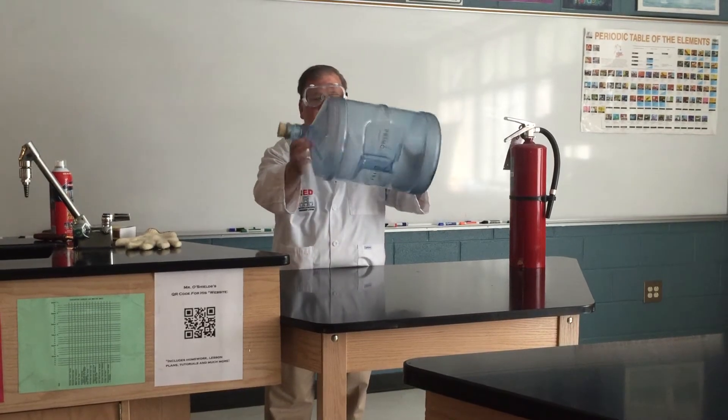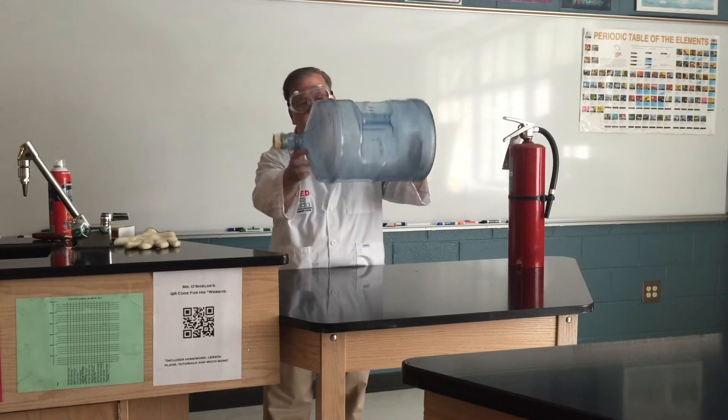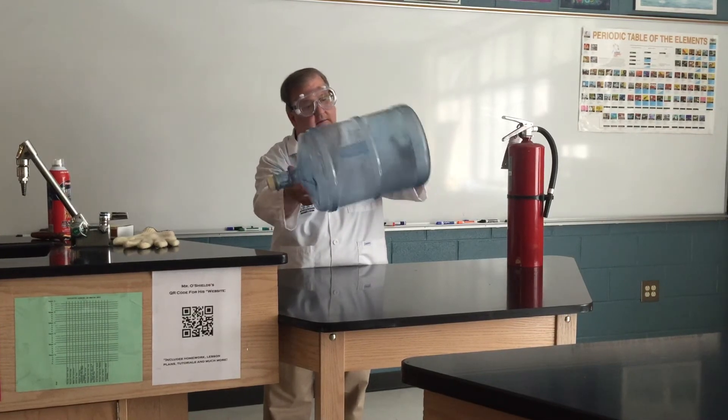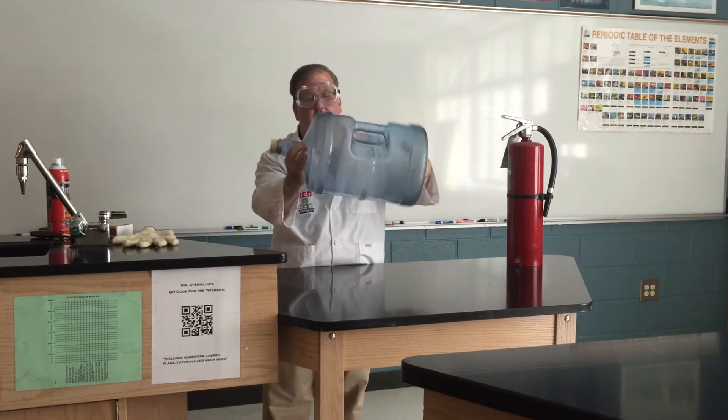In just a little bit I'm going to drop a match in and see what happens. When I drop the match in, I'm going to drop it in using crucible tongs so I can also stay a safe distance from the bottle. Already the rubbing alcohol starts to evaporate and we're generating a lot of vapor.